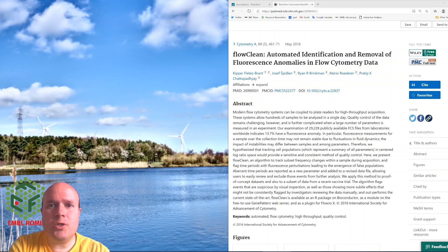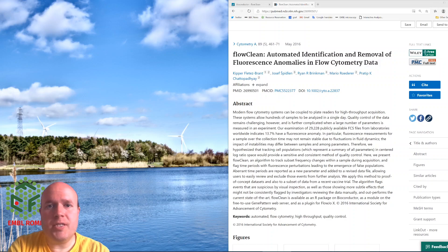Hello, today we're going to talk about the first step in your flow cytometry data analysis, which is cleaning your data and doing some quality control.